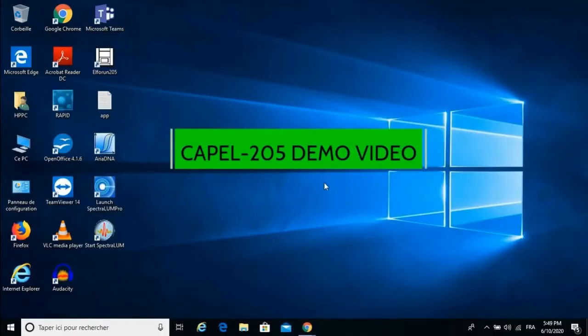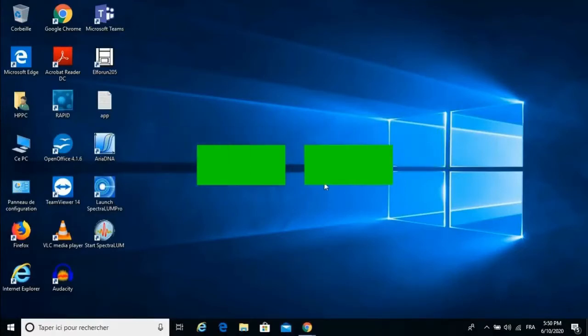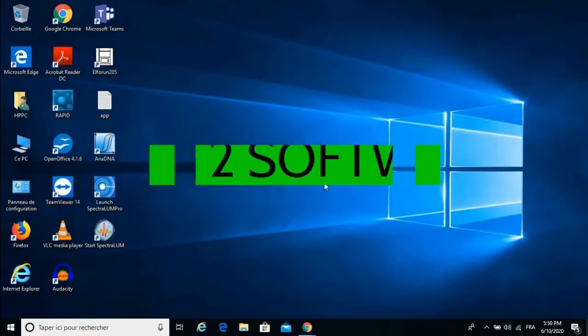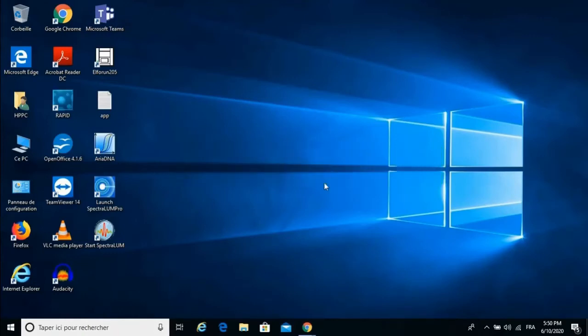All right, guys, we're going to jump into the software portion of our training, of our demonstration here. The software that we're going to be running is called LFORun. In order to launch LFORun, you just need to double click on the desktop icon. I'm highlighting it right now. I'll double click on it, and you'll see a splash screen appear showing LFORun, and then a box that will enable us to put in our operator name.